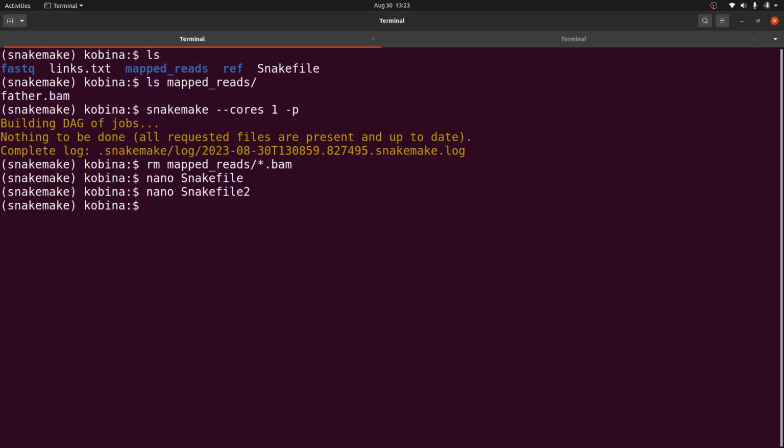Okay, so now we will do this. We are still going to get a summary, and we are also going to do a dry run. To get a summary, that's how we do it. We will just say snakemake --summary. And this time, because we are using snakefile2, that's a file, you have to say -s snakefile2. So let's execute this command.